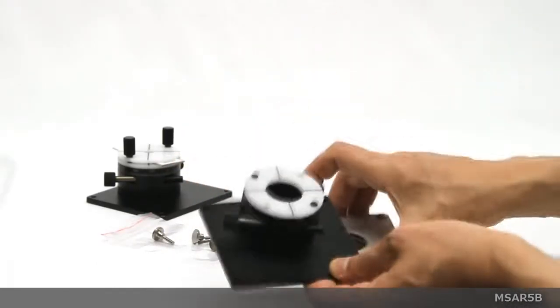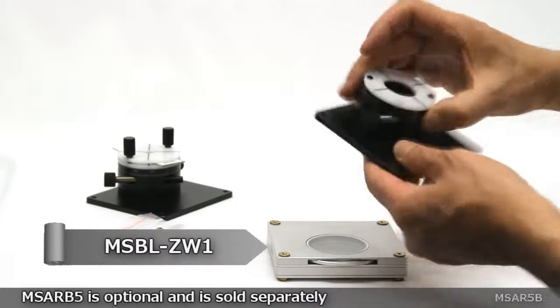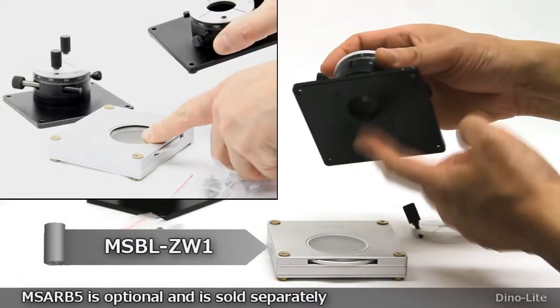Using the included screws, the MS-AR5B simply connects to the top of the polarizing backlight with the viewing hole above the light source.